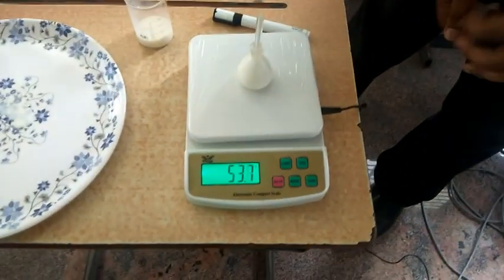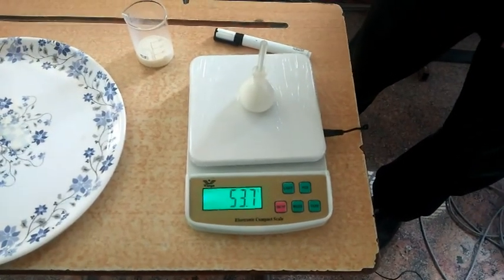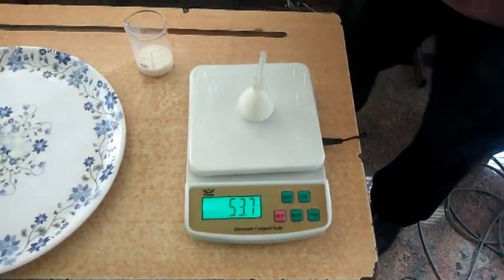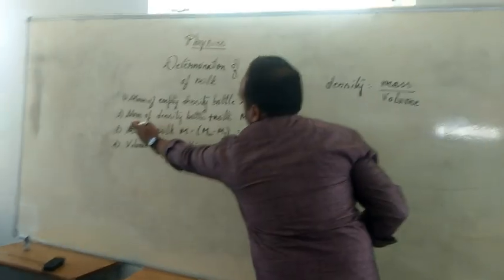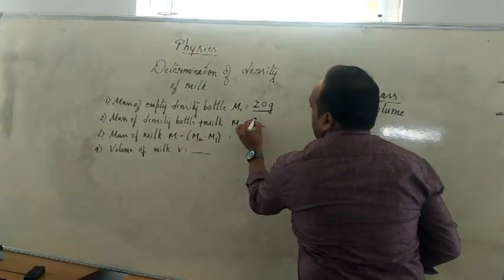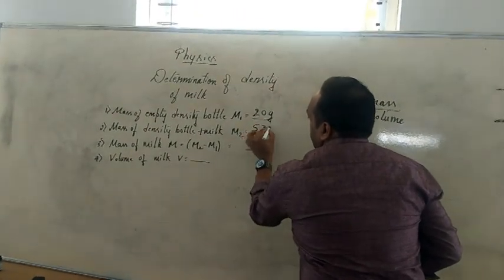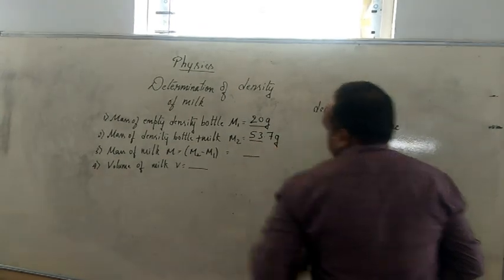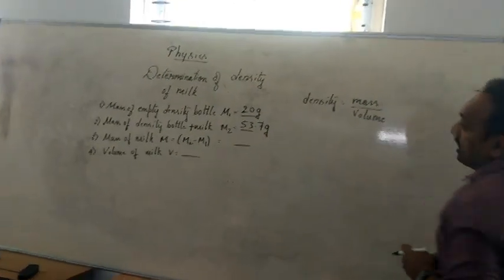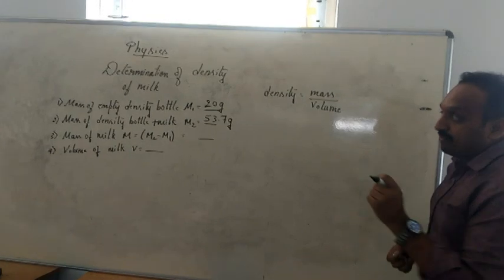The reading is 53.7. So the mass of density bottle plus milk is 53.7 gram. Now I should find the mass of the milk alone.